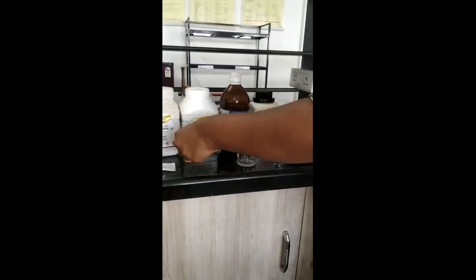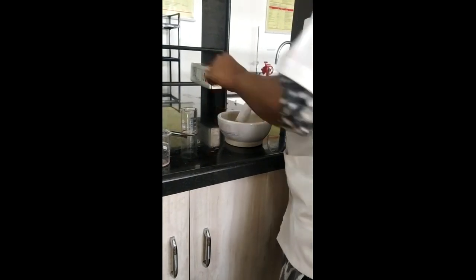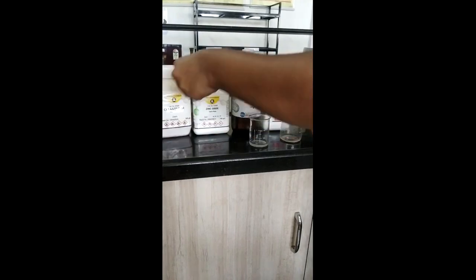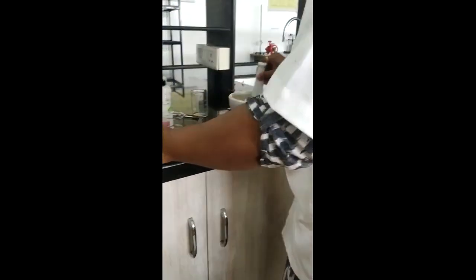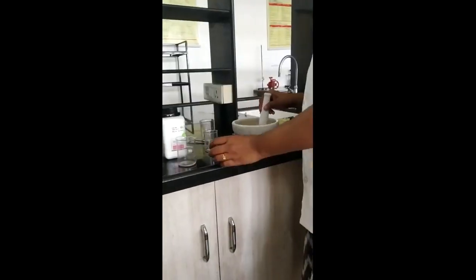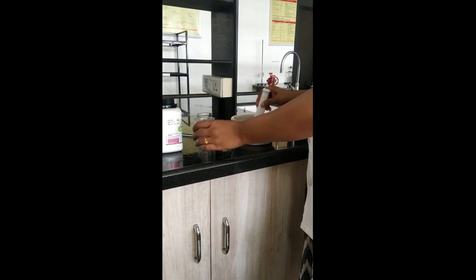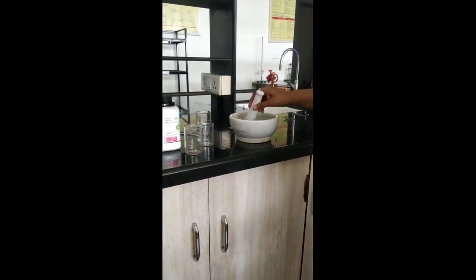I am going to add this zinc oxide and then calamine into this mortar, and after that I am also going to add this olive oil into it, and then we will proceed for trituration. Then after that I am going to add this calcium hydroxide solution into it. Then again we will triturate it properly.